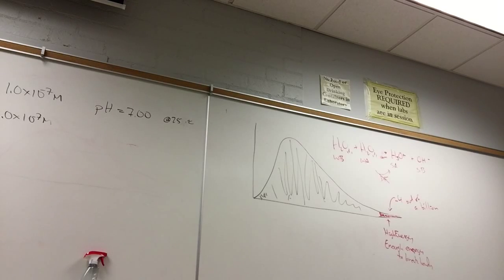The pH 7 is neutral. At a different temperature, is it still neutral? And so that's the tricky thing about pH, and it's something we'll talk about later. But what we do is we kind of adjust or normalize the pH. So if the temperature changes, we recalibrate everything so it still reads 7.